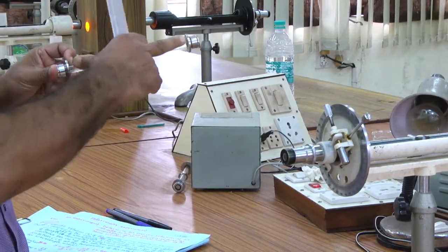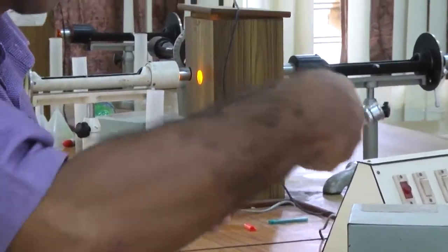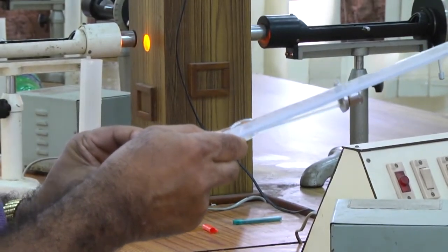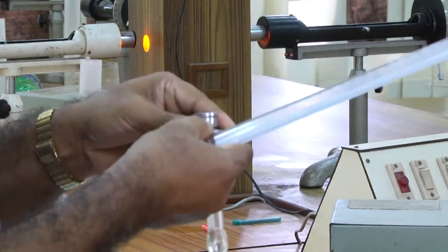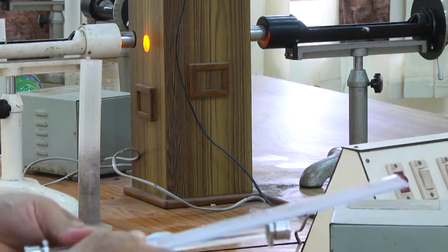I don't think this is the length. The length from here to here, where water is, at these two ends, is 20. I can see this is 20.